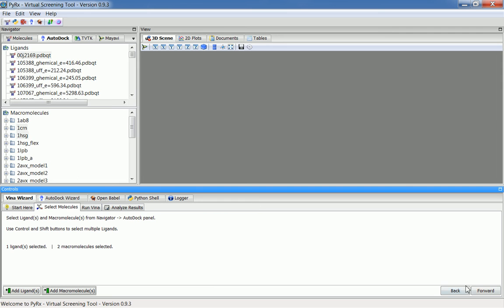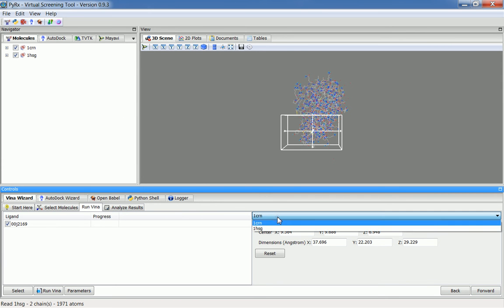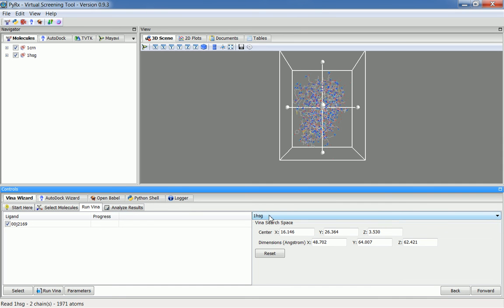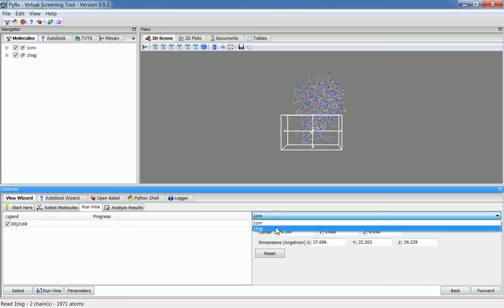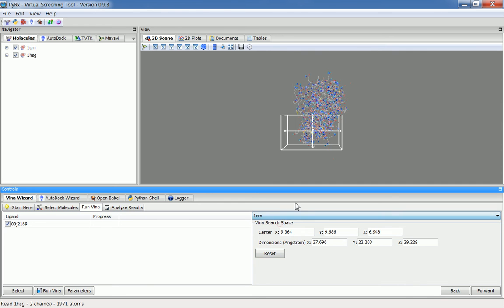I'll click Forward. In this tab, you'll see that there is now a drop-down list where you can select the receptor or macromolecule you are working with. When you select a particular receptor, it will show you the search box. By default, PyRx maximizes the search space so that it will include all the atoms of your macromolecule. This way, you won't have to go through each receptor or macromolecule and change the grid dimension for each one individually.